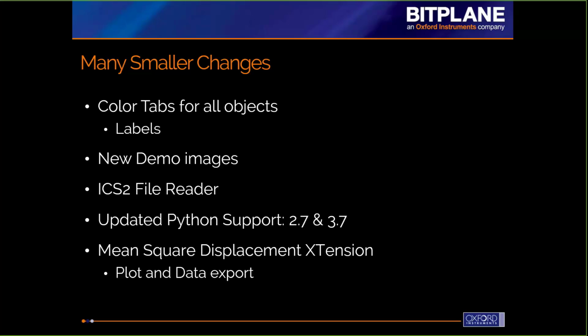We also have an ICS2 file reader. That had been something that the community had asked for. We're seeing that being used more often, and so that's now included. And again, you can convert those files over into Imaris files and then open them within Imaris.